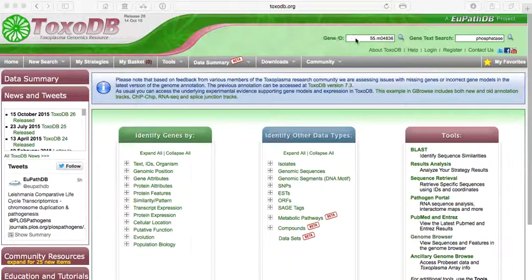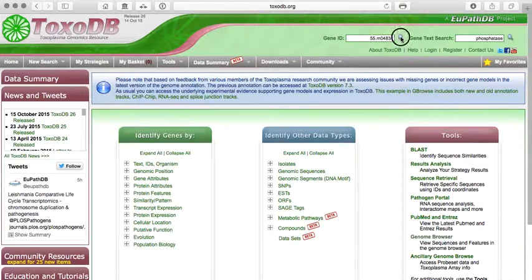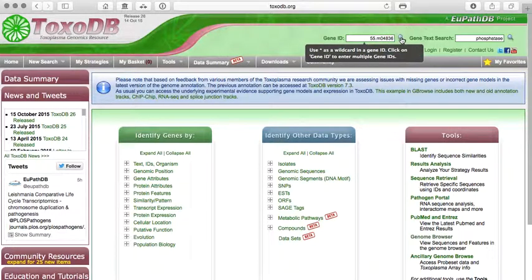So if we look up here, a gene ID. If you knew the gene ID for a specific gene, you can type it in and you can go specifically to that gene and take a look at it, that gene page, which then, imagine the description of a book.